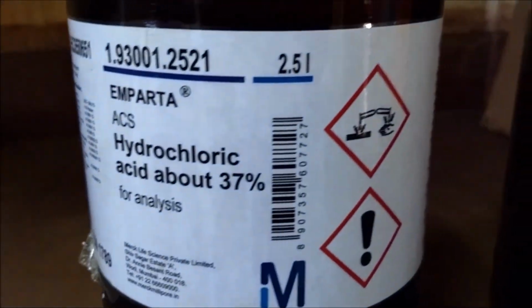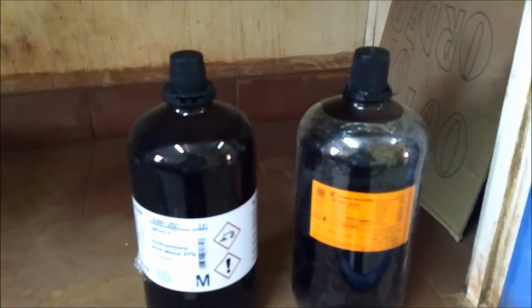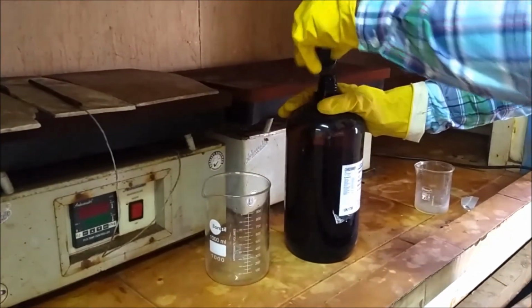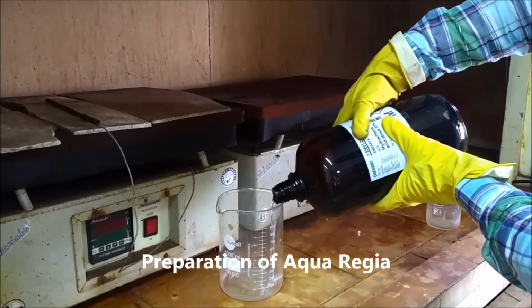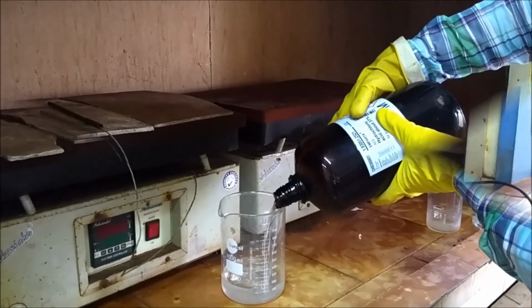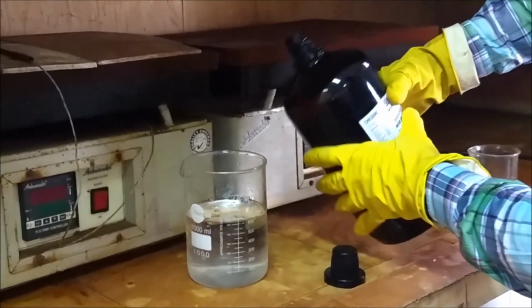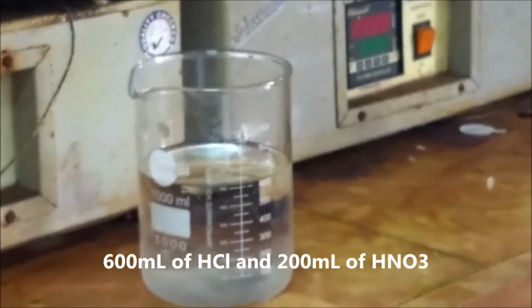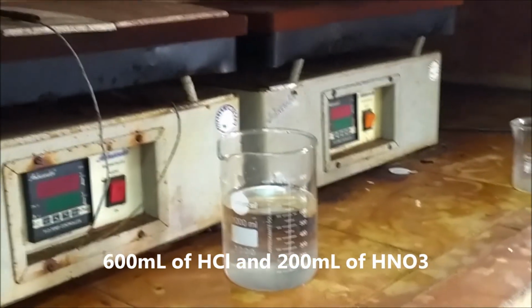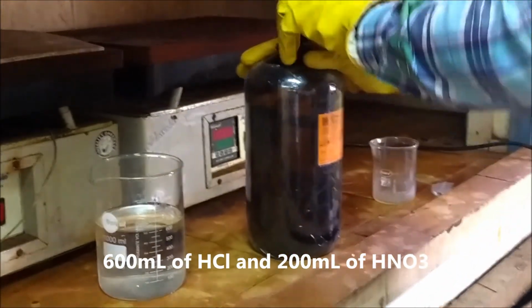Now the next step is to add aqua regia on this. For this we need HCl and nitric acid, 3:1 ratio, we know very well. Now we have to be very cautious about this. By wearing gloves we will add HCl to the 1 liter beaker, 600 ml. So according to the ratio we need 200 ml HNO3 for this to make 800 ml aqua regia.